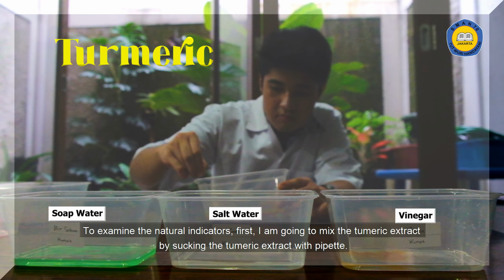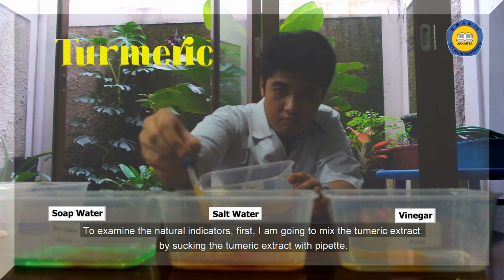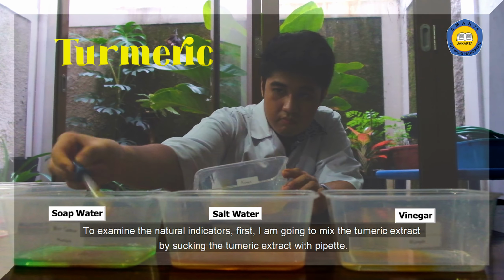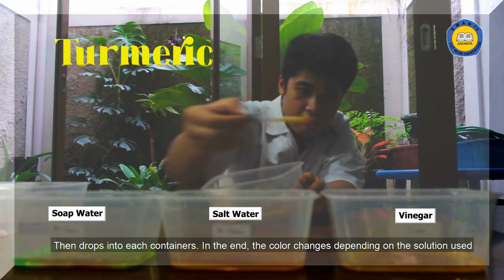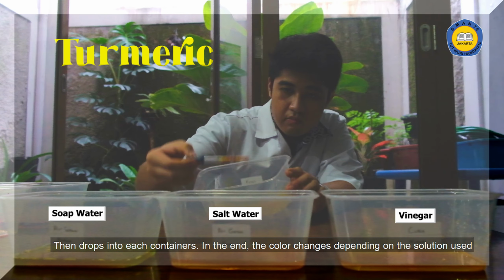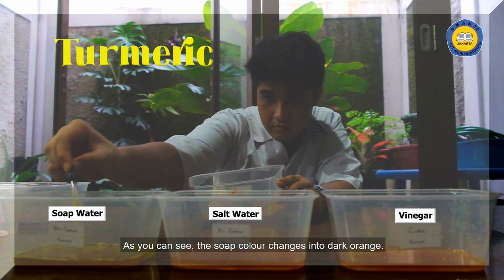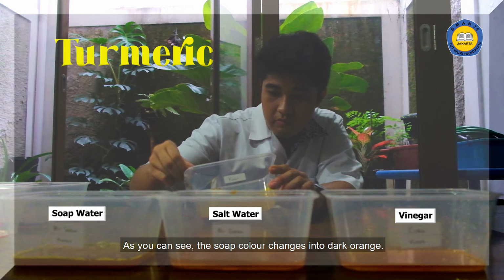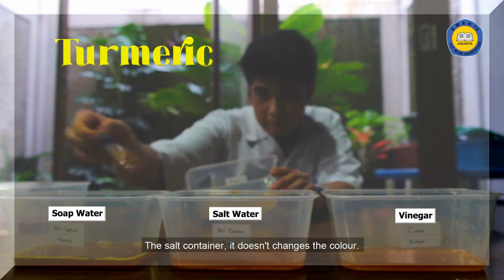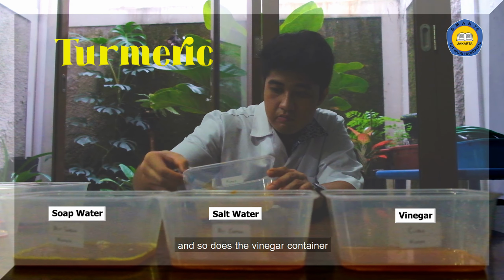To examine the natural indicators, first, I'm going to mix the turmeric extract by sucking the turmeric extract with a pipette. Then, drop it into each container. In the end, the color changes depending on the solution used. As you can see, the soap color changes into dark orange. The salt container doesn't change color, and so does the vinegar container.